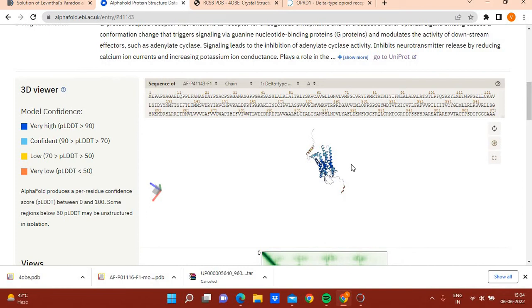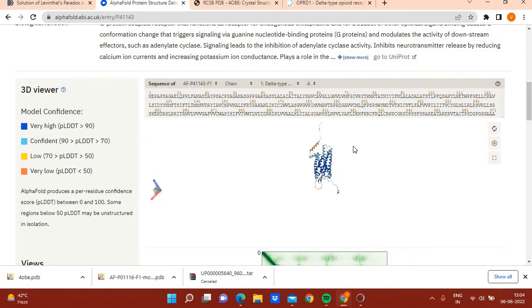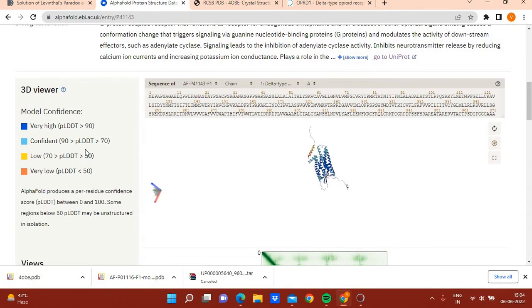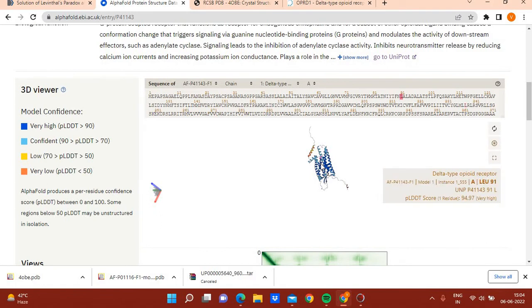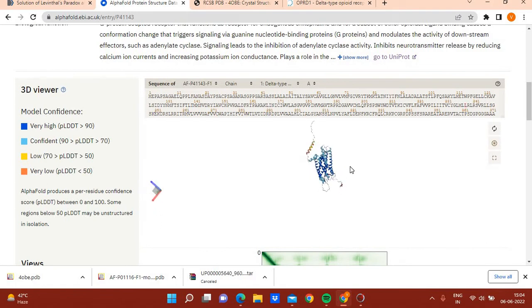The region which has very low confidence — you can remove that region and keep only those regions which have very high confidence. It's better to remove those regions which have been predicted at very low confidence.